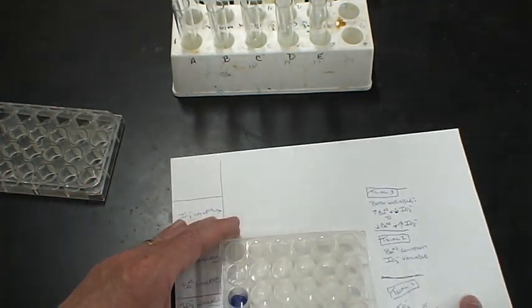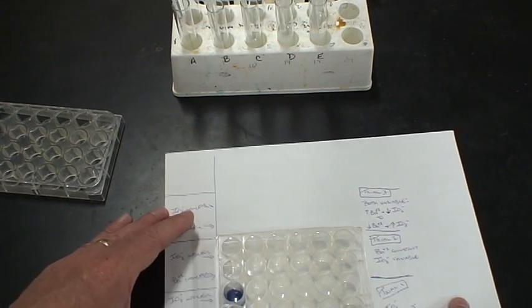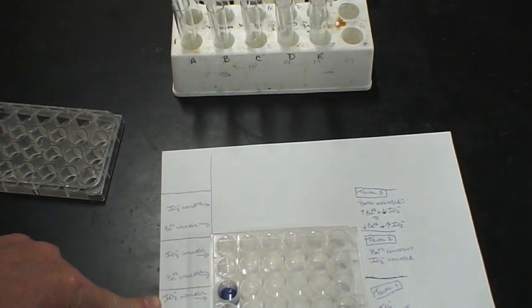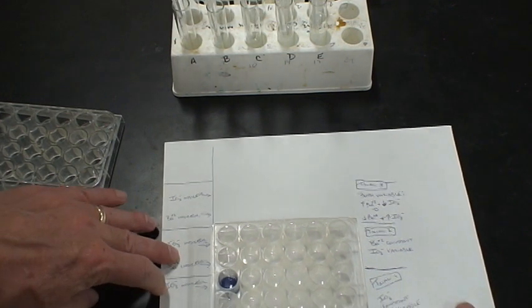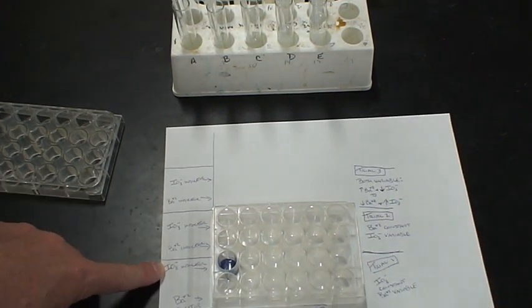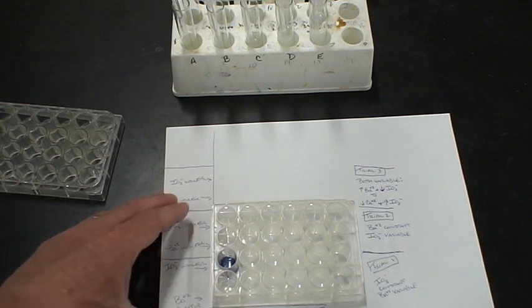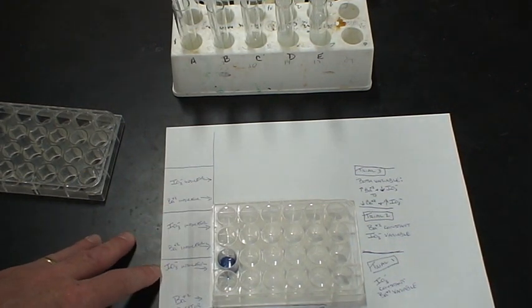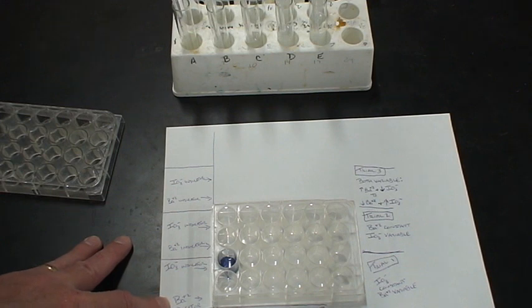So the question is, what does this tell us? Remember, this is the row that indicates for iodate. So the question is which test tube contained leftover, or what we call excess, iodate? This is the row that indicates leftover, or excess, barium.